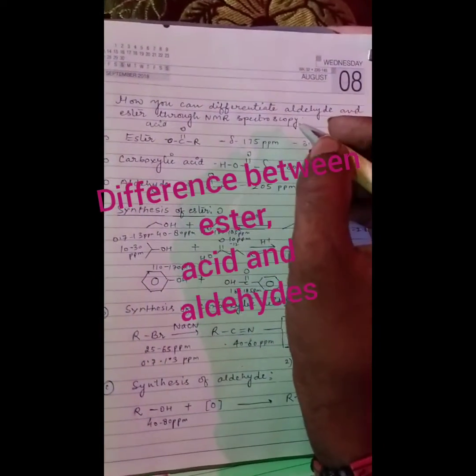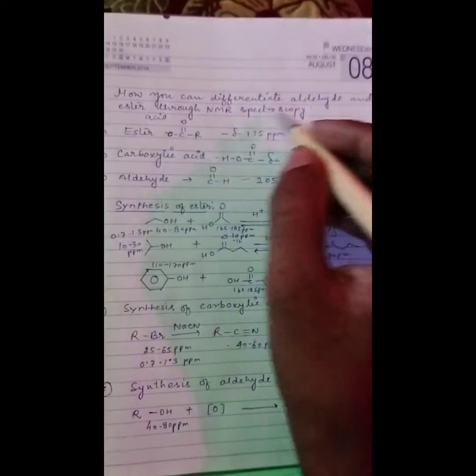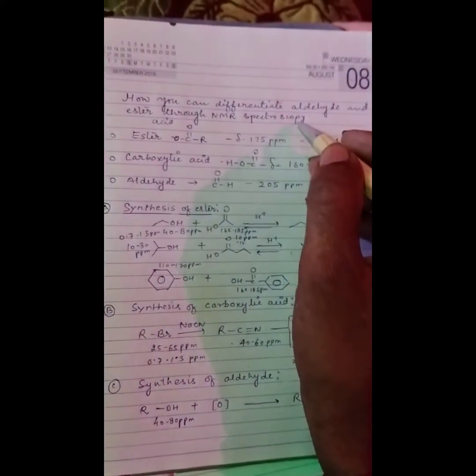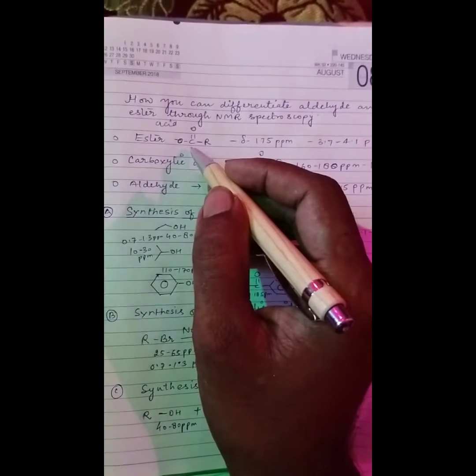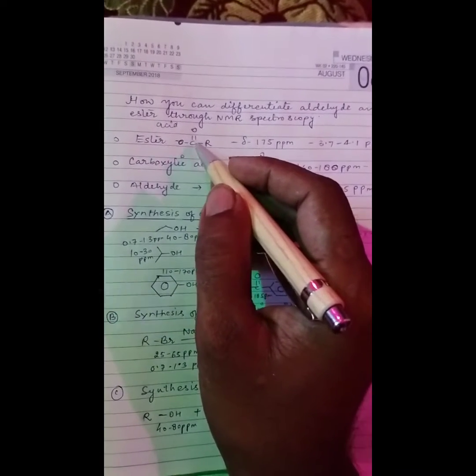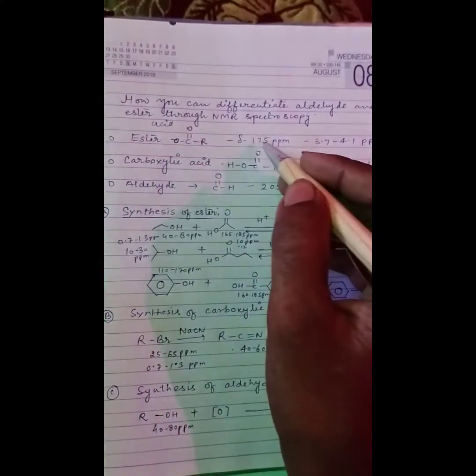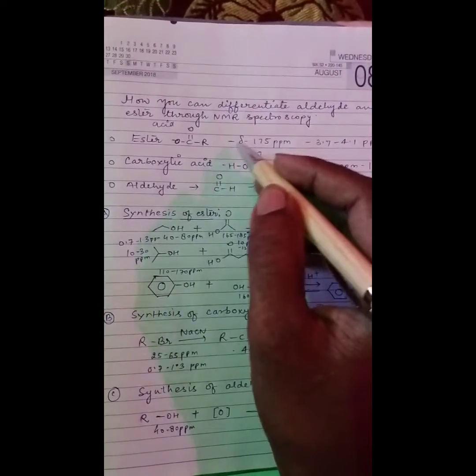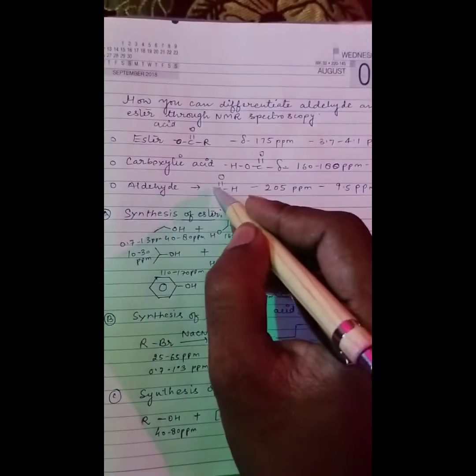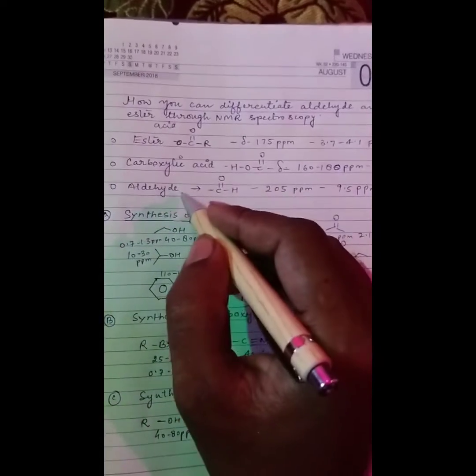Welcome to this lecture. In this lecture we'll study how you can differentiate aldehyde, ester and acid through NMR spectroscopy. If you see the ester, the molecular structure is RCOOR, and in this you can see the carbon is attached to the oxygen. Another compound is aldehyde, which, as all of you know, is RCHO. CHO is the main functional moiety of the aldehyde.